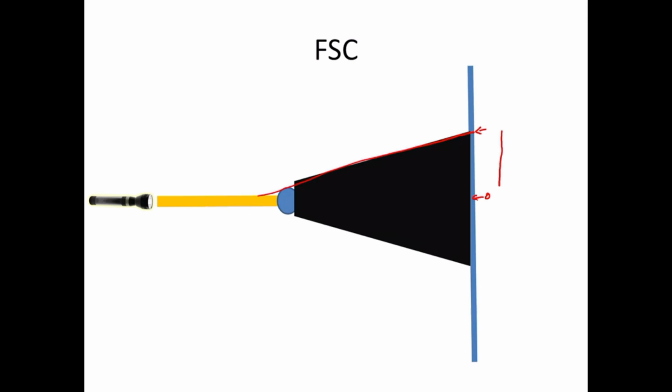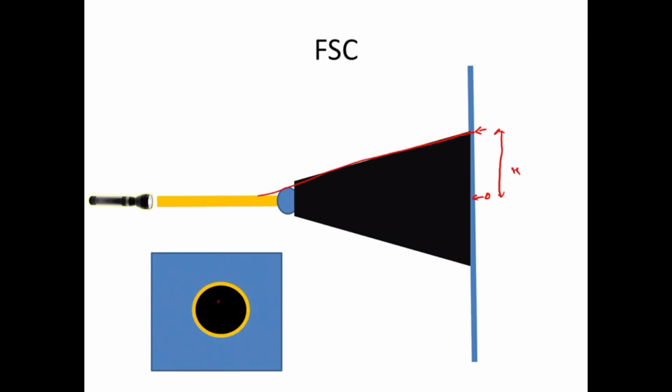And this will be seen in two dimensions in the form of a shadow at the center and some amount of light falling along the edges of this shadow. Now this will appear in the form of a circle when a single cell is flowing or obstructing the path of the light at one time point. The area of this circle is going to be equal to pi r square, and r in the current setting is equal to forward scatter height.